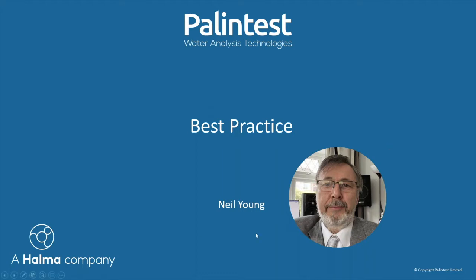In this section of the webinar, I'd like to run through some best practice guidelines to help you get the best possible results you can from your Palintest photometer.